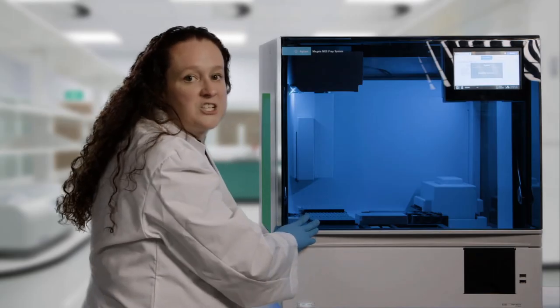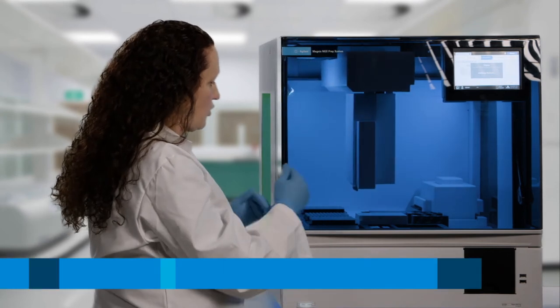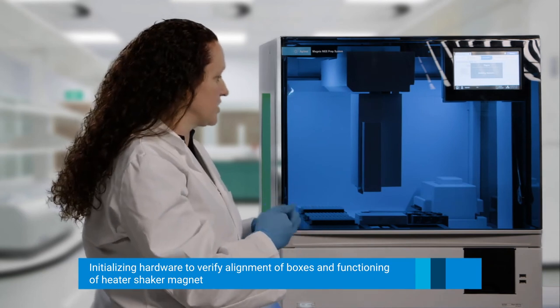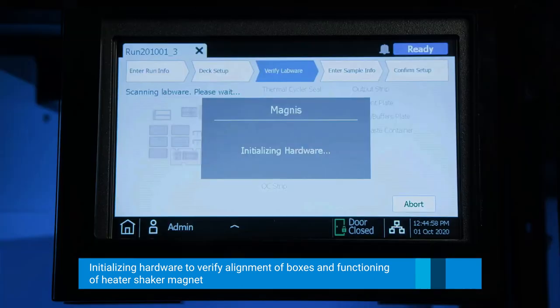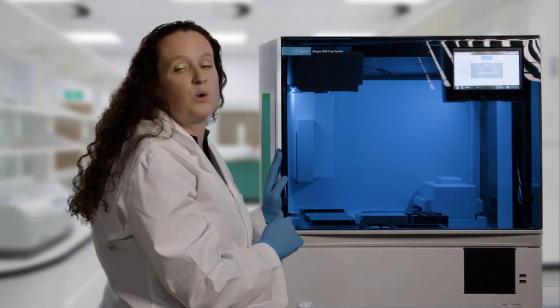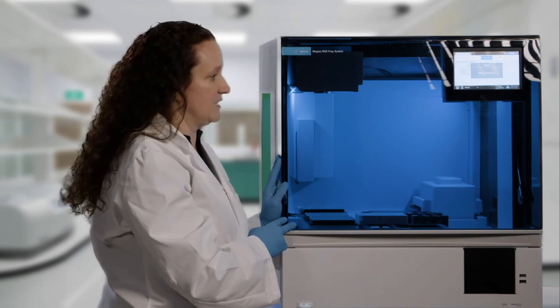Now it's going through an initializing process where it's going to initialize all the hardware — going through and making sure that the X, Y, and Z axes are functioning properly, that the thermal cycler is functioning, the heater shaker magnet, and everything needed to proceed with the protocol. This takes a few seconds to initialize everything, and then it will check to make sure that all reagents are placed where they're supposed to be on the deck.